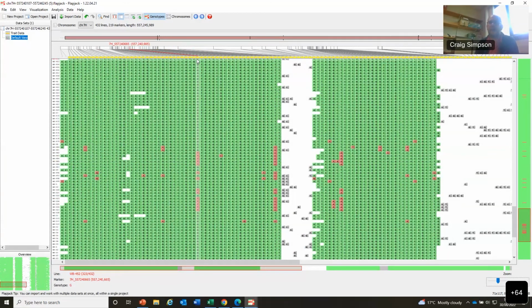So you can then go back and try to identify from there where it is. I mean, this is exome capture data, so there's a good possibility, but not an absolute possibility, that this is within a bit of exome, so a bit of coding sequence, which then you can design your KASP assays for and do what you want to do.